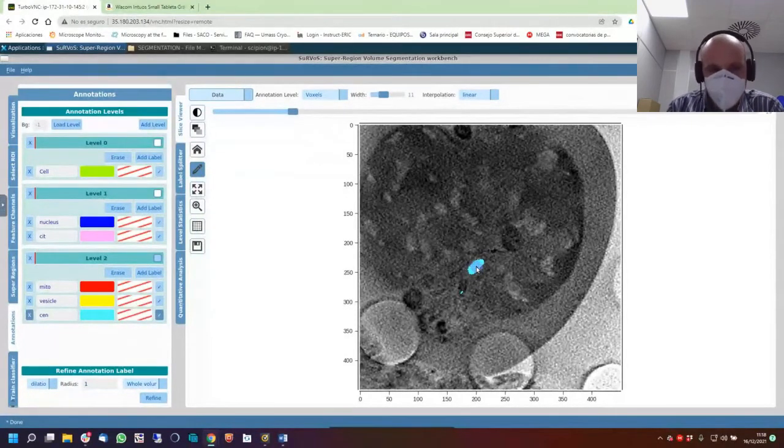You know what I mean? Ah, okay. They could not be centrosome and mitochondria. They would be centrosome or mitochondria or vesicle. Okay. But that nucleus could be part of the cell. But this is something that doesn't matter. So you can do whatever you want on that. Okay. Thank you.